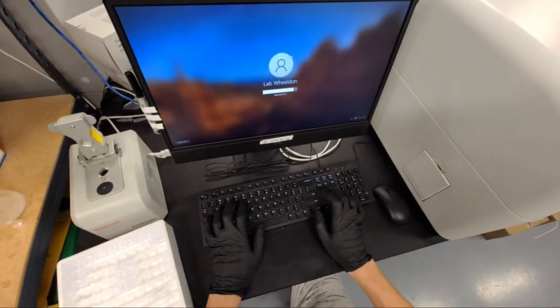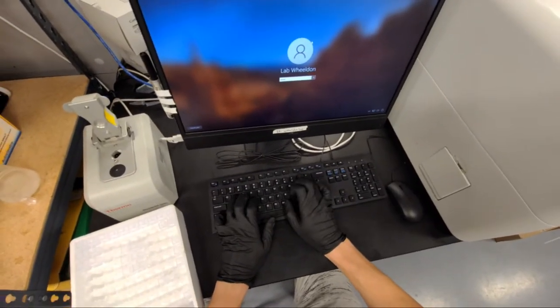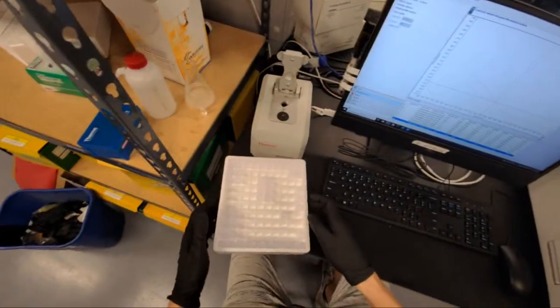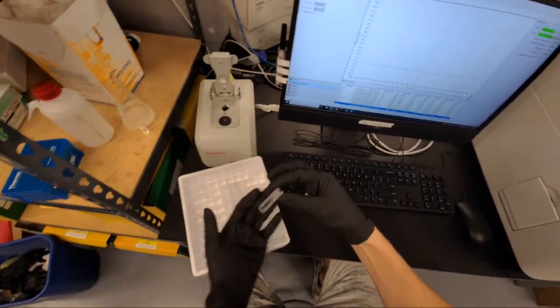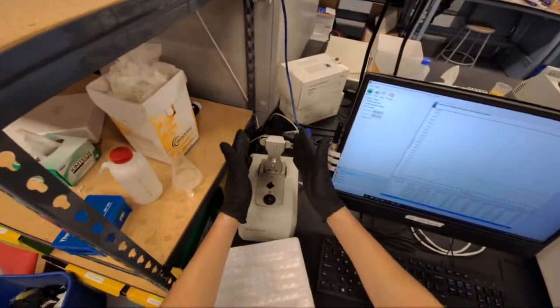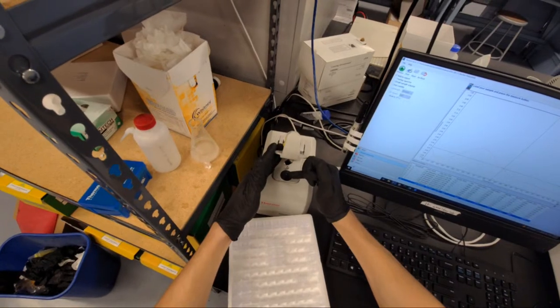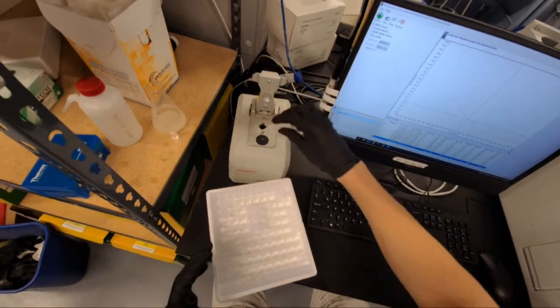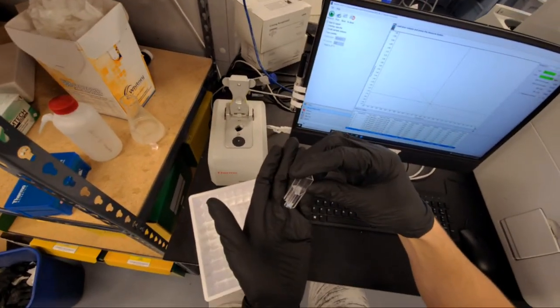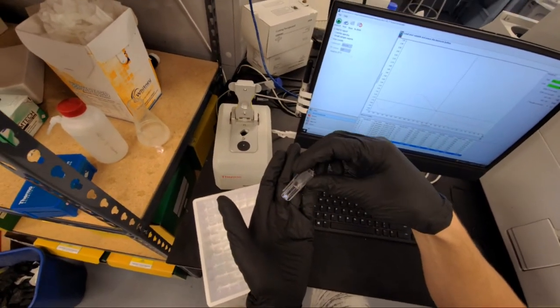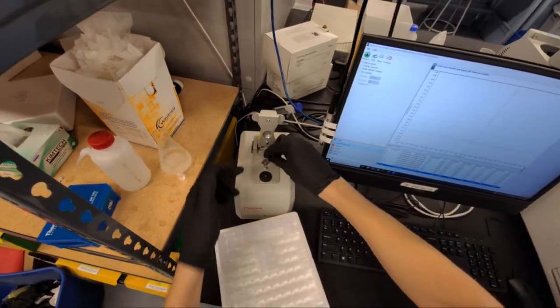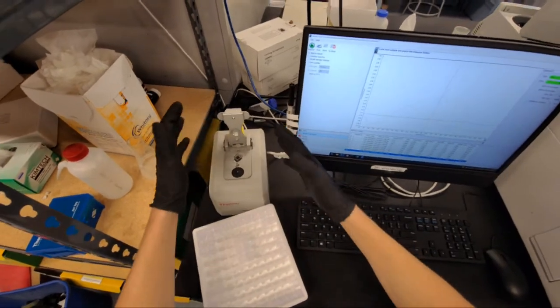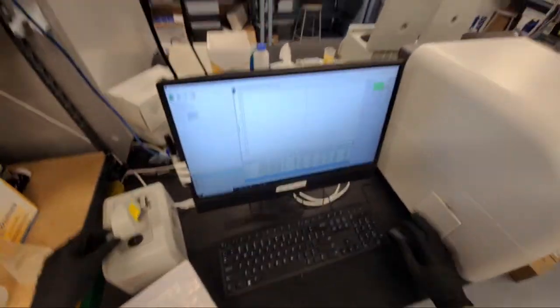So we have an extra one. I don't know if you noticed, but this is a blank here. This is the nanodrop, so you can put a microliter drop of liquid to measure DNA there. Or you can put a cuvette in here to measure optical density. And that's what we're going to do. We're just going to make sure there's no bubbles on the side of the cuvette. And we'll put it in. There's an arrow that shows where the light goes through. I like to push the cuvette into this corner so that it's just consistently in the same place every time.